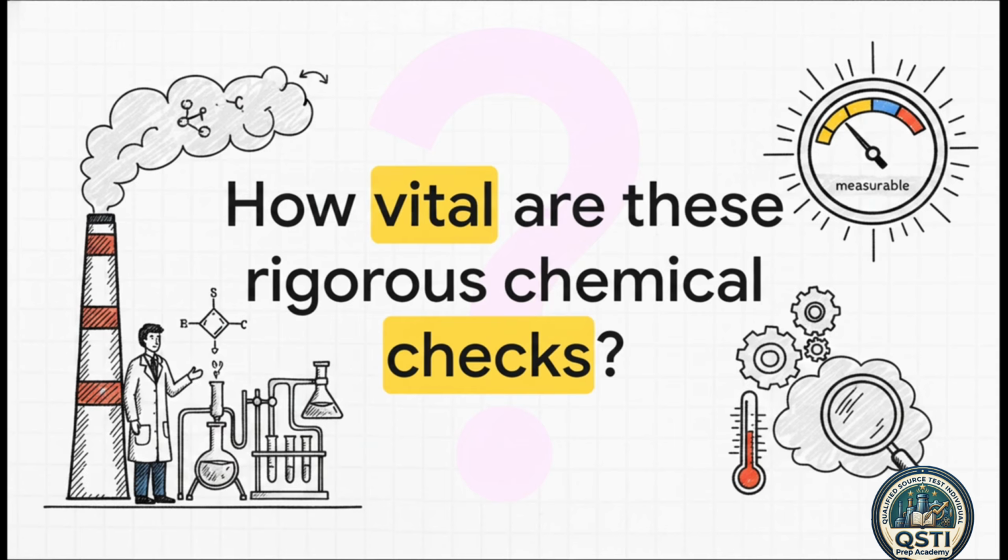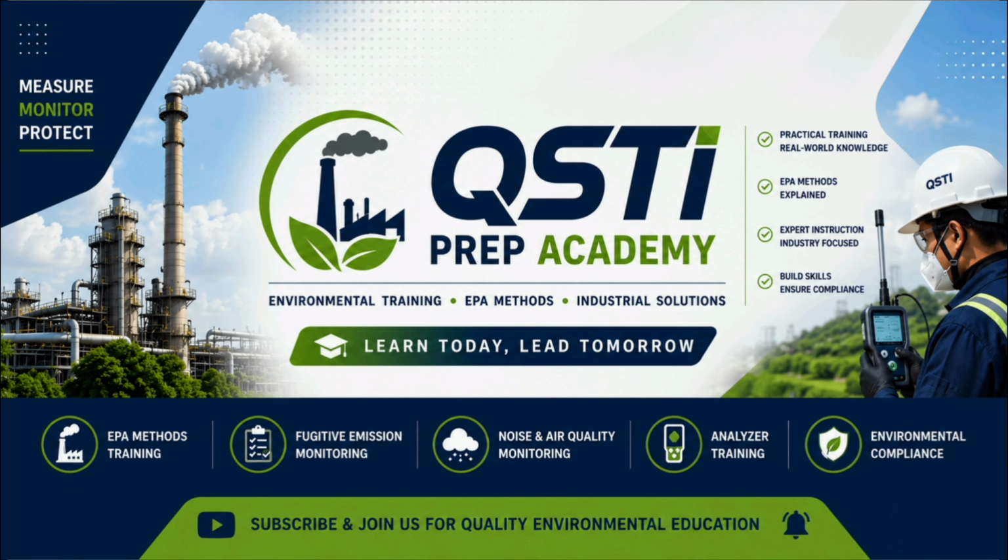Without this incredibly methodical process, from the initial field scrubbing to the chemical transformations in the lab, right down to the strict equations that even factor in the barometric pressure of the room, how could we possibly hold stationary sources accountable for the air we all breathe? It is exactly this level of unseen, rigorous science that turns an invisible gas into a concrete, measurable reality.